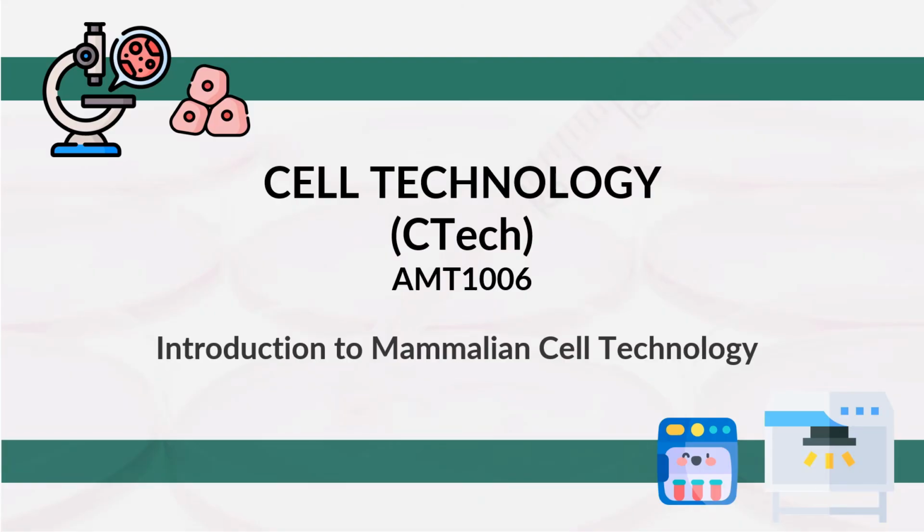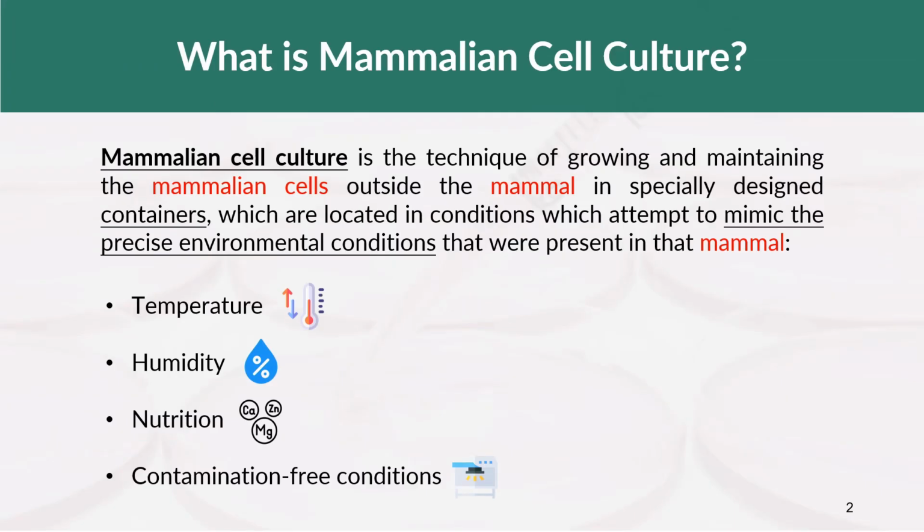There will be a set of 3 videos for this lecture that will cover the introduction to mammalian cell technology. Cell technology focuses specifically on mammalian cell culture, and it is very different from bacterial cell culture that perhaps you may be familiar with. So what is exactly mammalian cell culture?